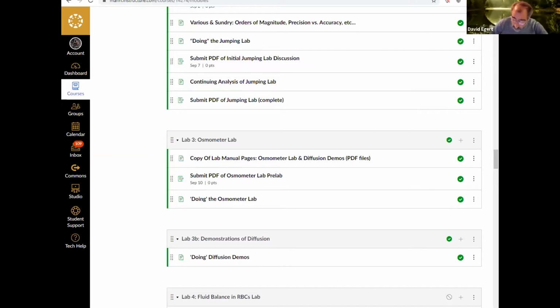So in order to think about this, we have the osmometer, which is basically, it's called a Thistle Tube. It's a little plastic thing like this. We're going to have our dialysis membrane on the bottom here.